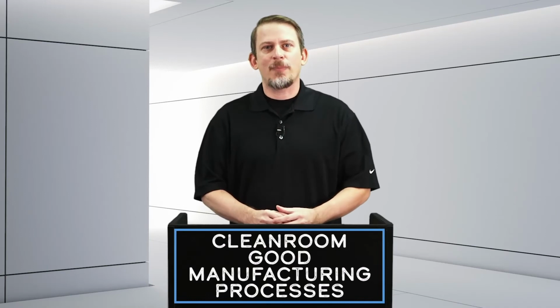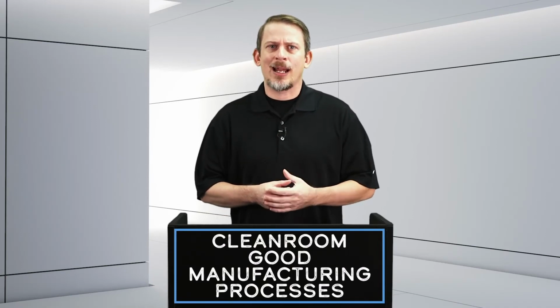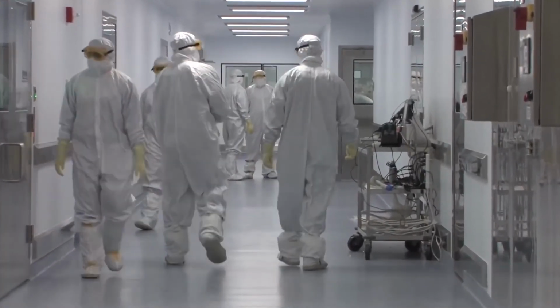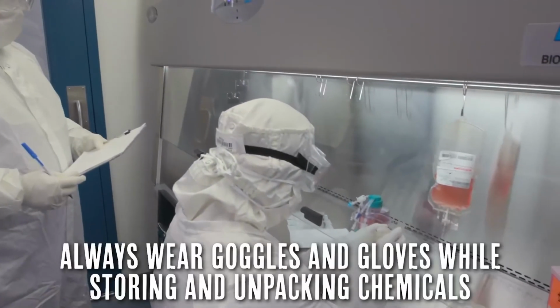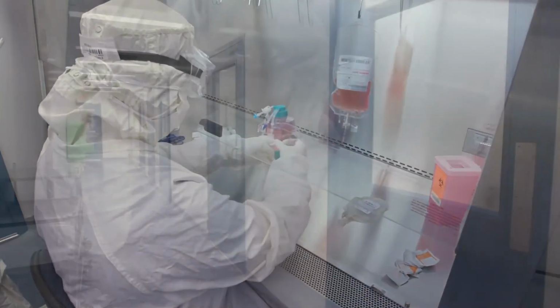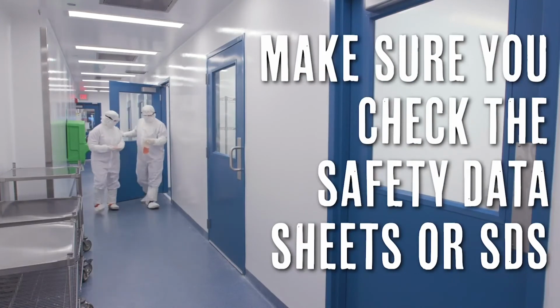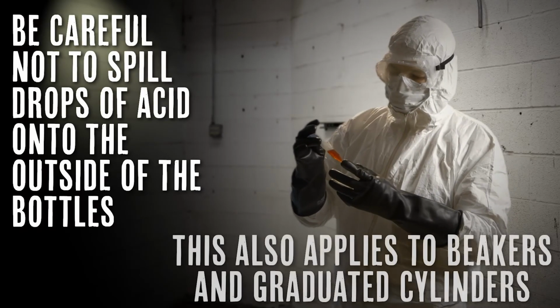Once you have prepared yourself by wearing the appropriate attire, there are a few more points you should remember when handling chemicals. Please follow these procedures whenever you handle chemicals or any other hazardous material. Always wear goggles and gloves while storing and unpacking chemicals. Those working with chemicals should be familiar with their properties. When in doubt, make sure you check the safety data sheets or SDS. Be careful not to spill drops of acid on the outside of the bottles. This also applies to beakers.